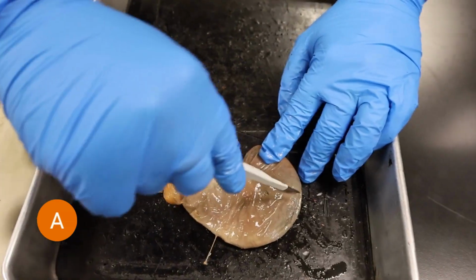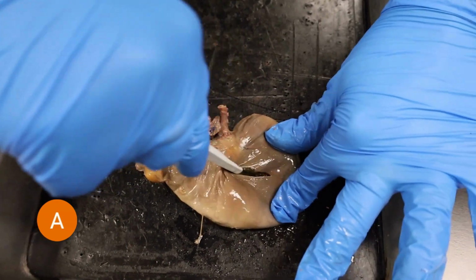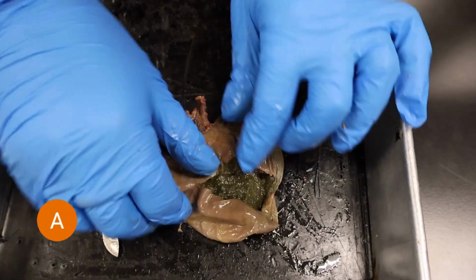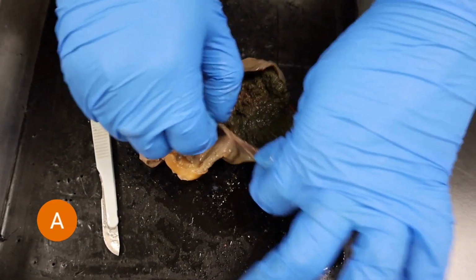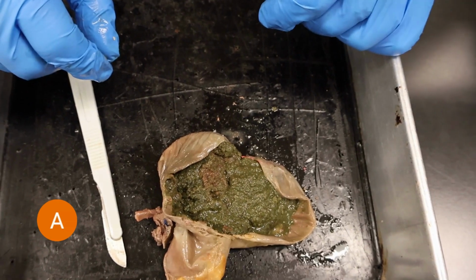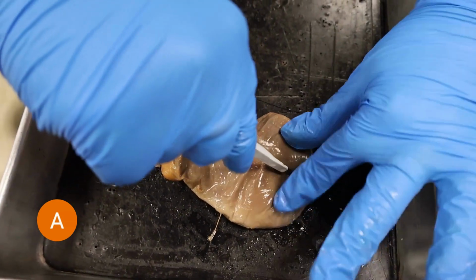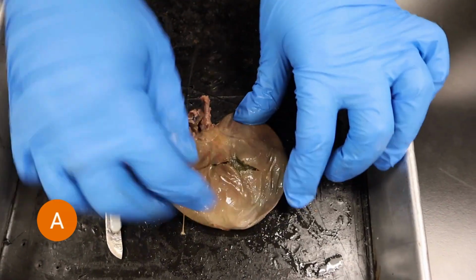Okay, so in this clip, Emily is actually cutting open the stomach, but I did want to discuss the cecum a little bit further and its great importance in rabbit digestion. So rabbits do consume a lot of cellulose as they are herbivores and consume a lot of plants, except mammals are not able to break down cellulose, and so that's why it has that adaptation of having a cecum as one of its organs. So the cecum does release microbiomes into the rabbit that allows it to digest cellulose more efficiently. So rabbits do consume their own waste as they need to digest it multiple times, but with the cecum, it does allow it to break through that cellulose and absorb as much nutrients as possible.